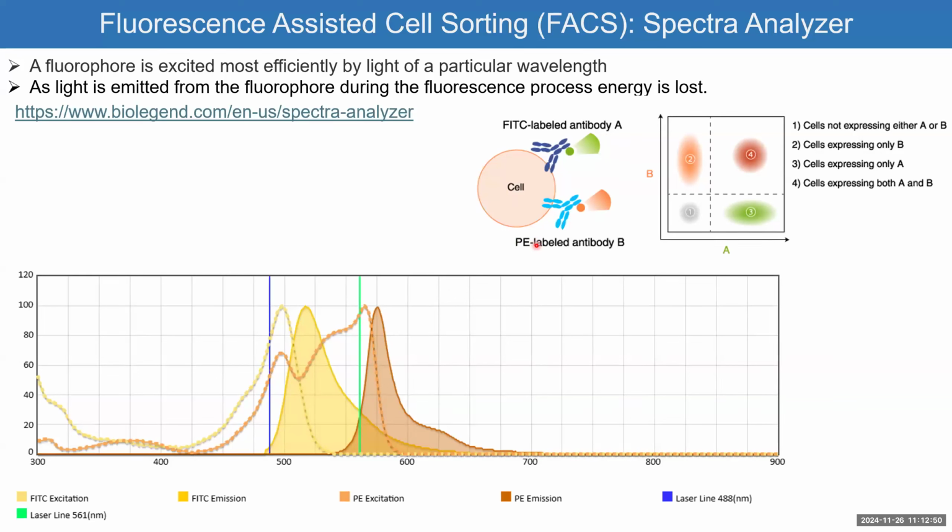And if I excite the FITC with this laser, you can see here, it's going to emit light there.